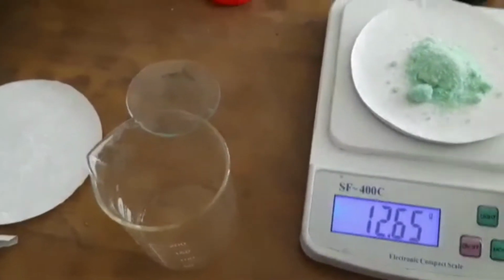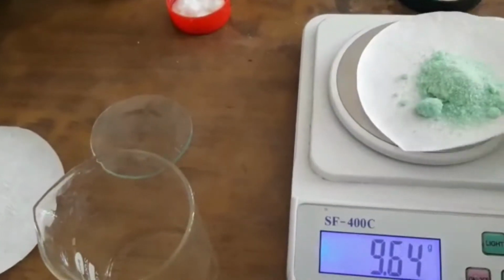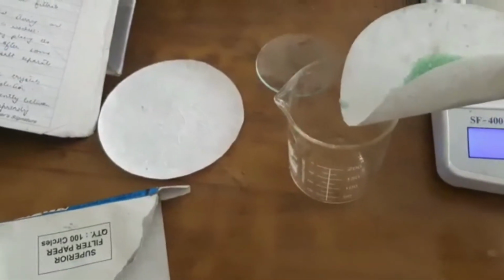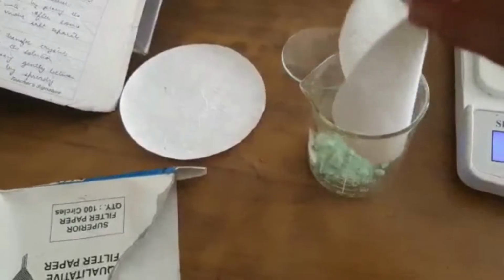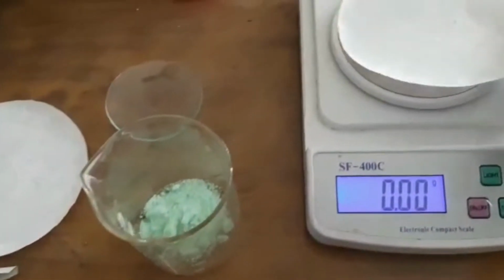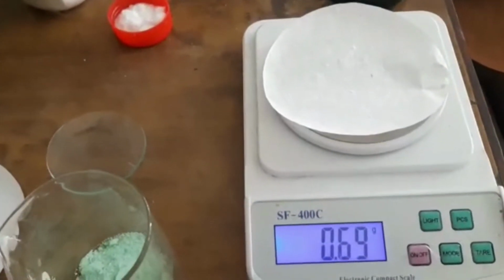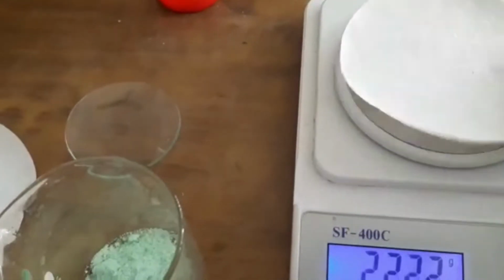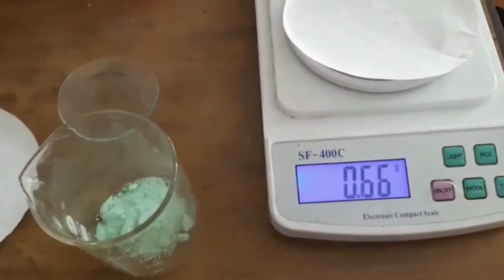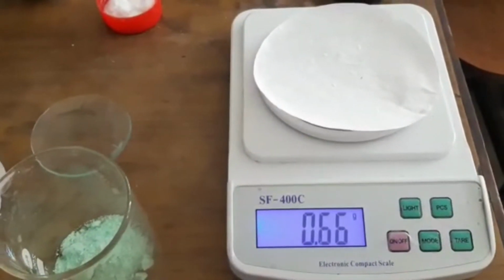Now we will transfer these contents into a beaker without spilling off any. So I am going to transfer the contents into this beaker. And now we will weigh 6 gram ammonium sulfate. So I can read the initial is 0.66.